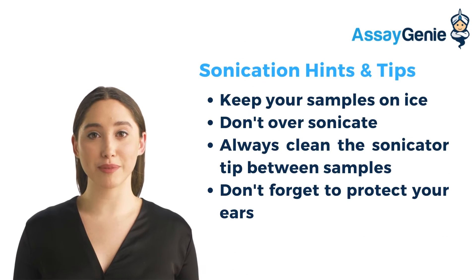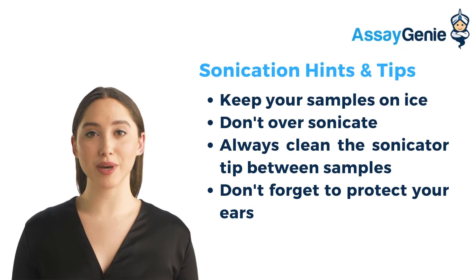Here are some tips to remember when performing sonication. You should always keep your samples on ice when performing sonication to prevent your proteins degrading from the heat of the sonicator. Don't over-sonicate. Ensure to clean the sonicator tip to limit protein carryover. And don't forget to protect your ears by wearing the correct ear protection.